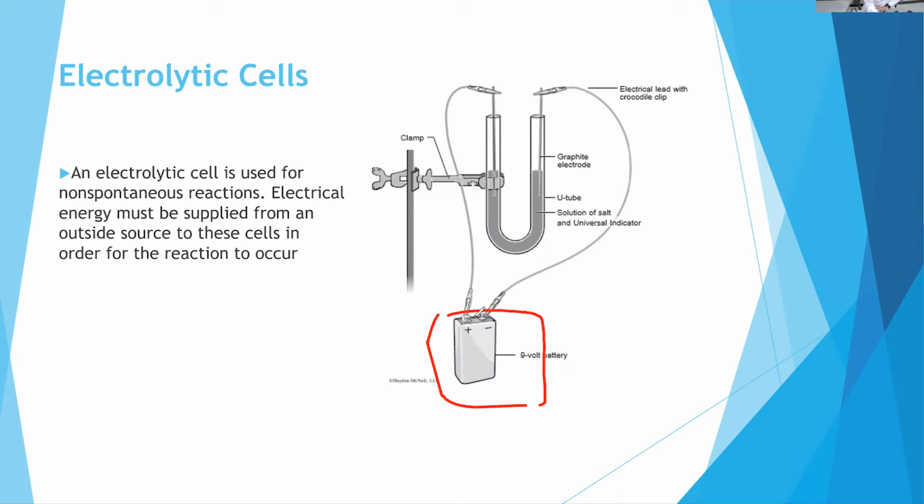We are going to study 4 different reactions, and for each reaction, when you read the lab manual, it gives you 2 possible reactions for the oxidation and 2 possible reactions for reduction. We are going to base our experiment and justification on the evidence of which one actually took place, which one was reduced, or which one was oxidized.